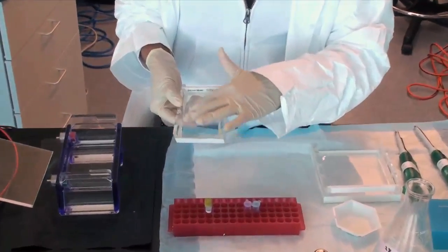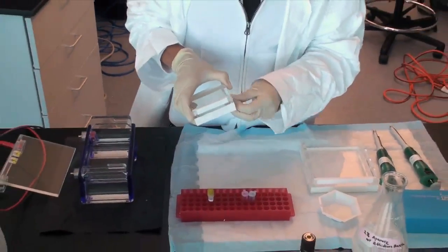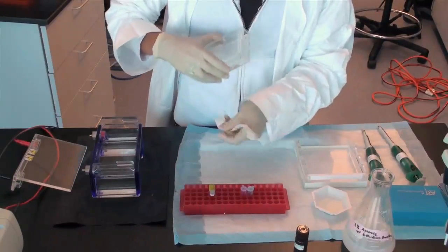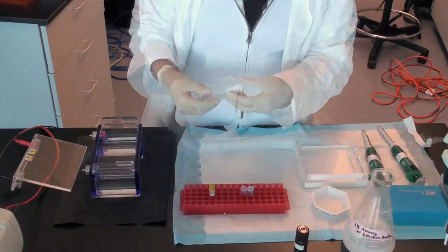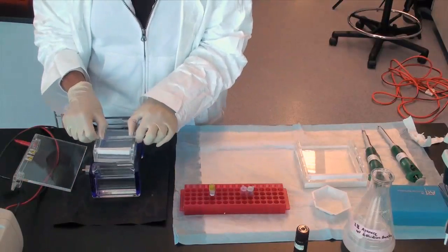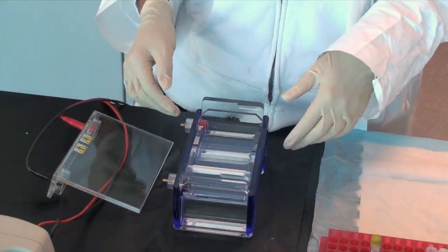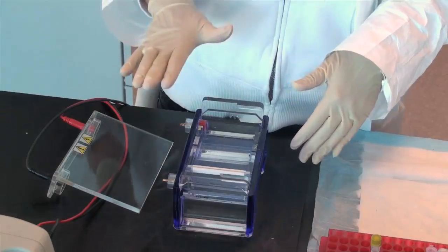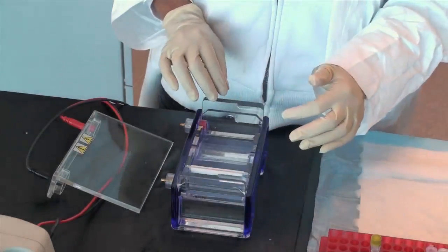When the gel has solidified, remove the tape or rubber seal and the comb. Place it into an electrophoresis tank which includes 0.5x TAE or 0.5x TBE buffer. There should be enough TAE or TBE buffer to cover the gel and make contact with the electrodes.